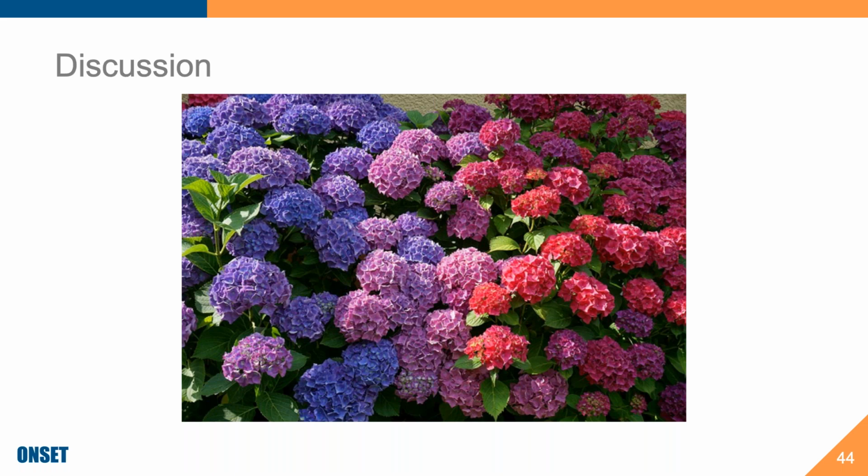For mitigating that, some manufacturers have brushes. Based off of my discussion about not touching the glass bulb, I'm still wary of the brush thing. Some manufacturers are using UV lighting.